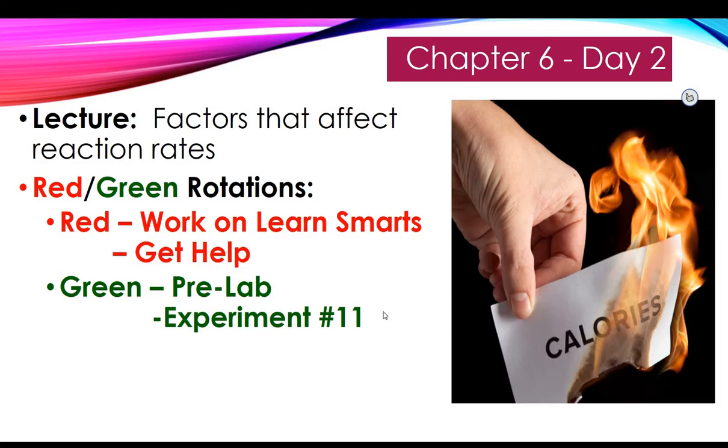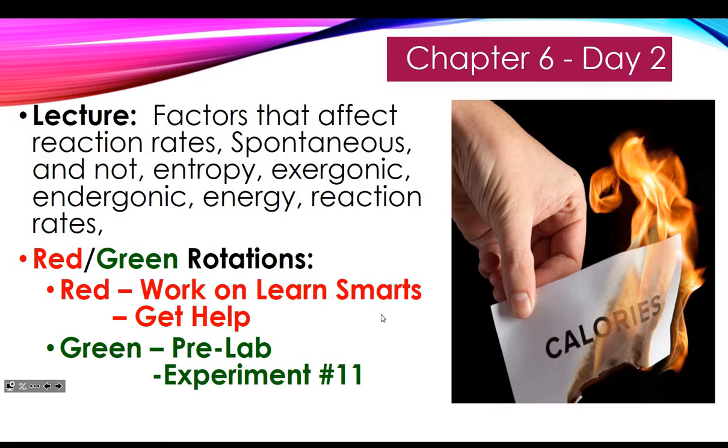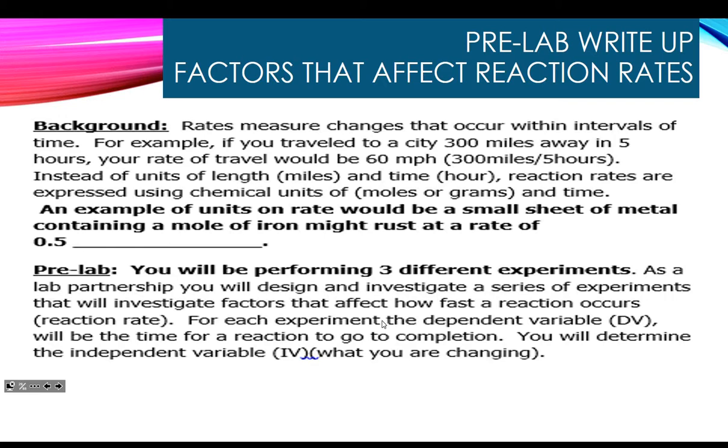So we're going to go through the lab. Now this lab takes a pretty hefty write-up to start with. It's going to be working with reaction rates, and there's A, B, C, D, and E parts. A through D have to do with what we call clock reactions. And clock reactions are reactions that, when you mix them together, change color after a period of time. And you're going to mess with different things going on with that. You're going to have to be familiar with that.